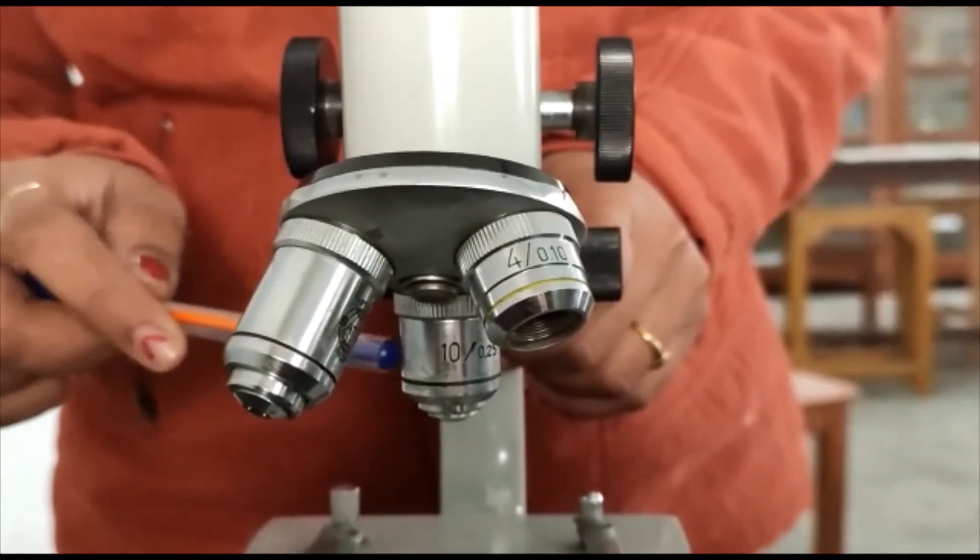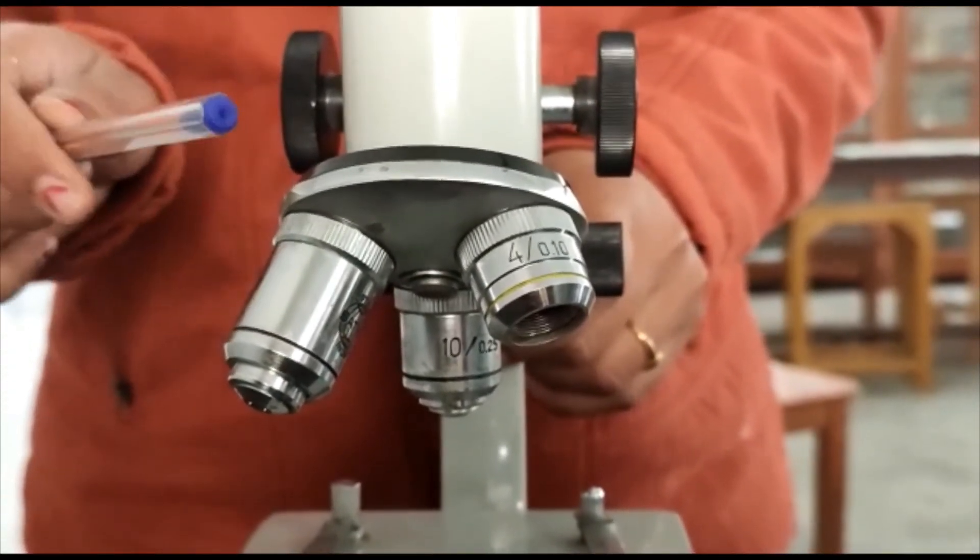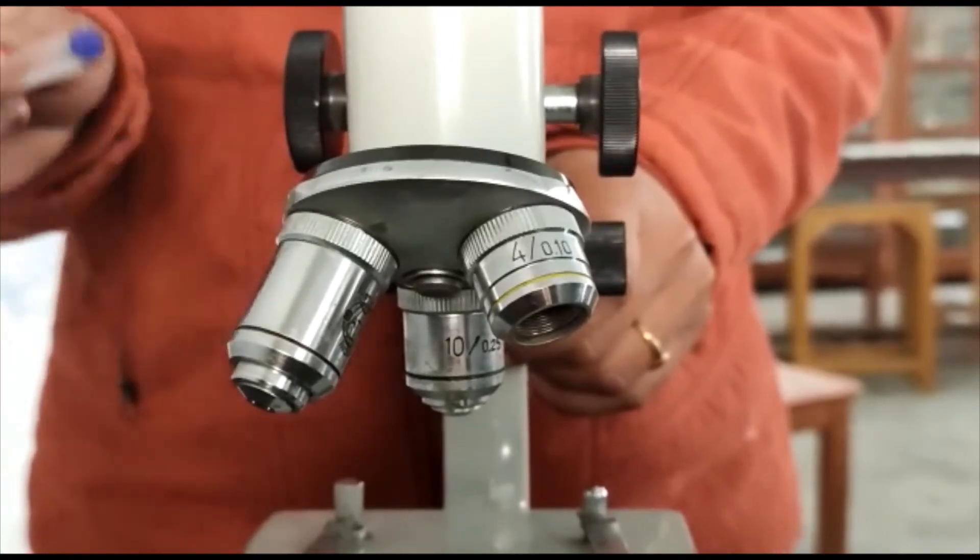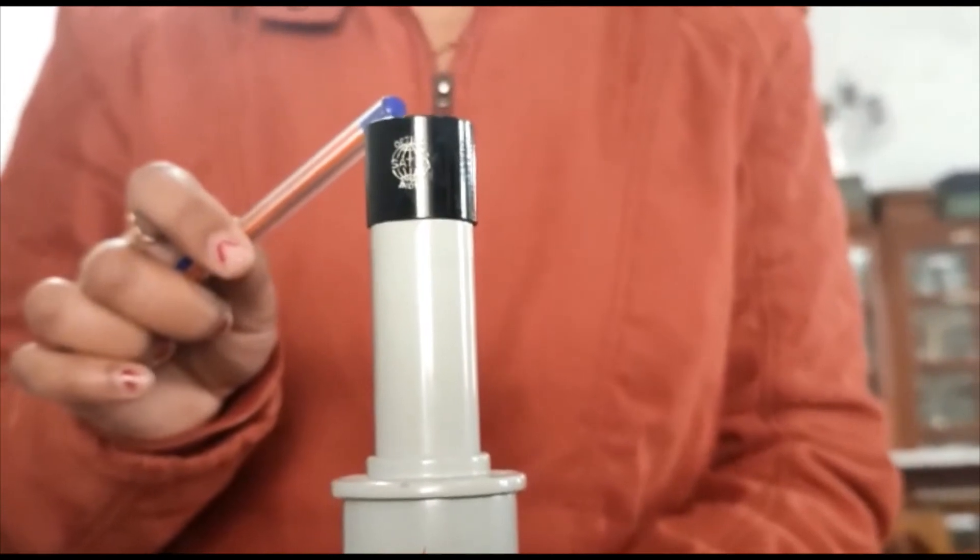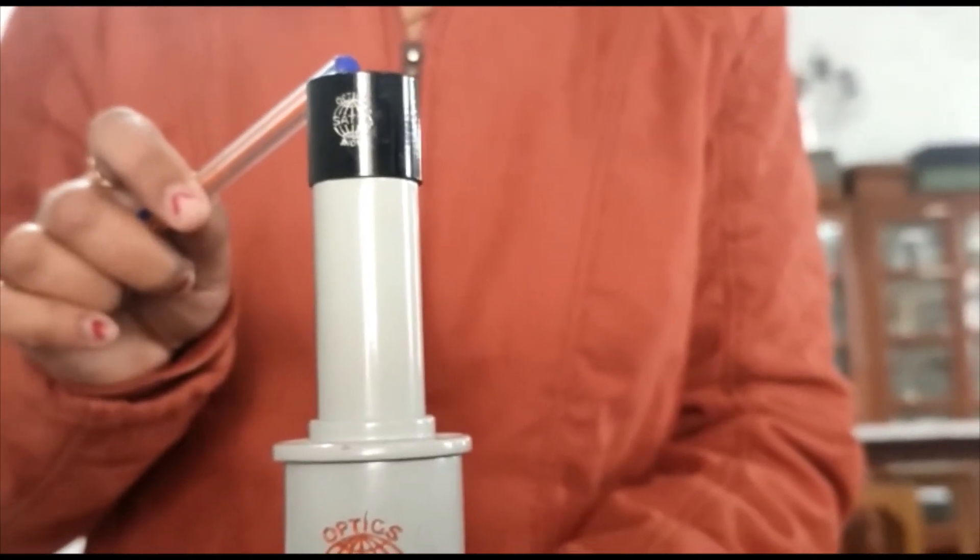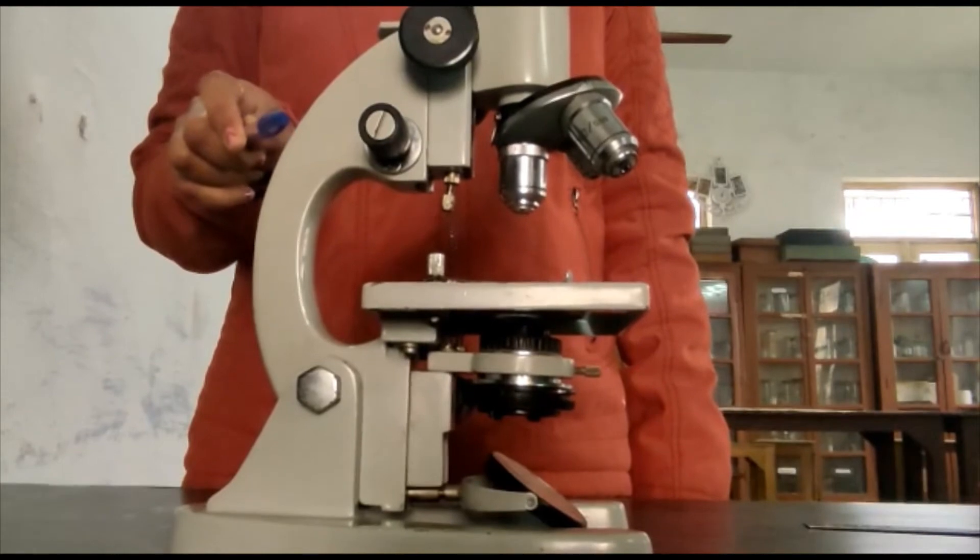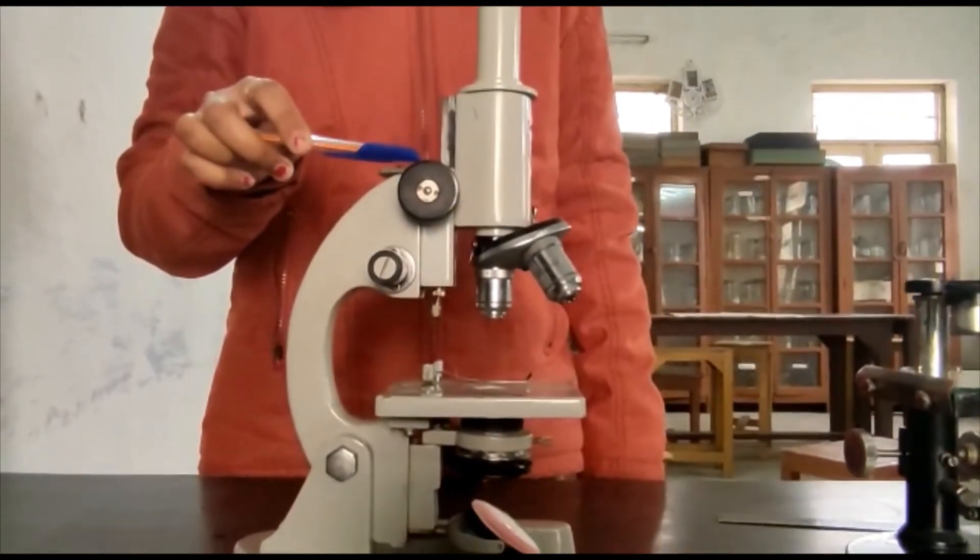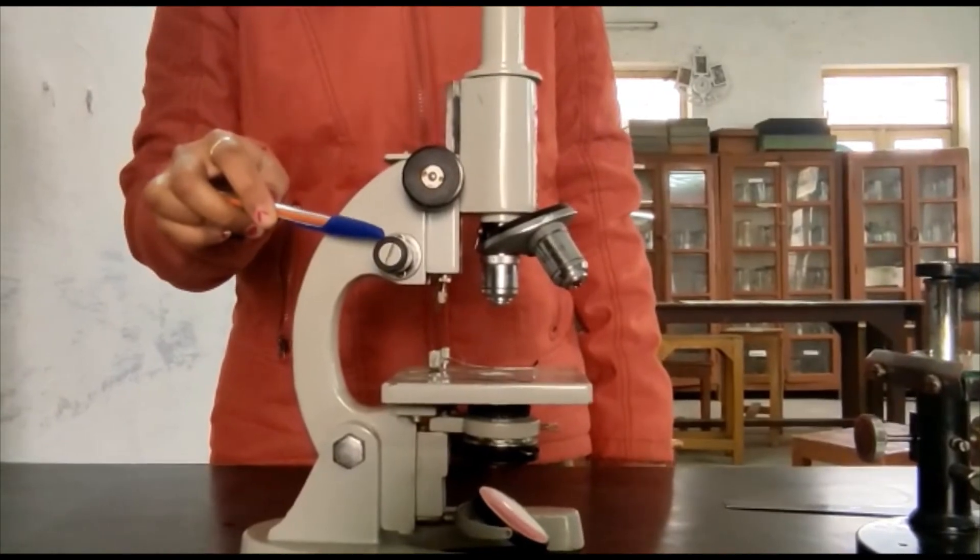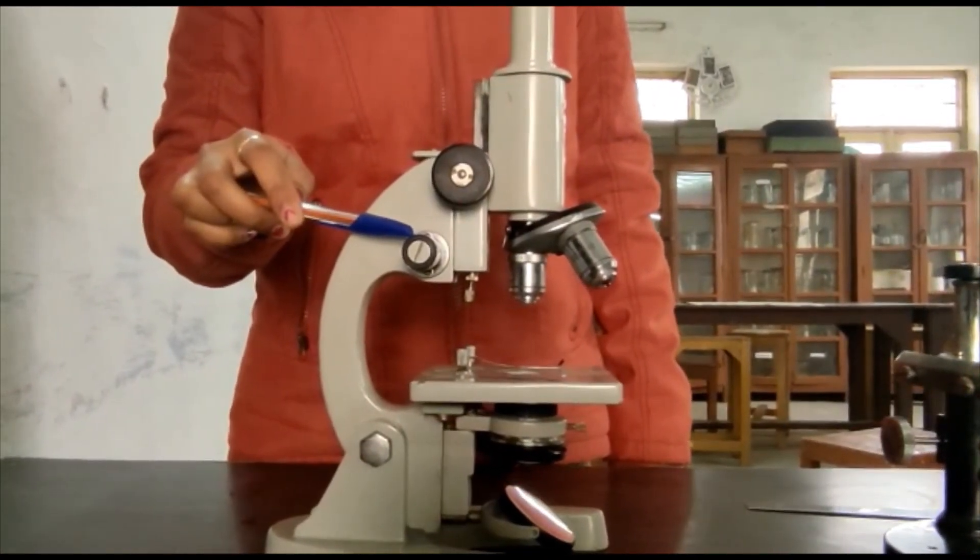Here this is the nose piece and objective lenses of high power and low power attached with it. Next is the body tube and at the upper end this is the eyepiece or ocular lens. Next is arm and here are two adjustments: coarse adjustment and fine adjustment.